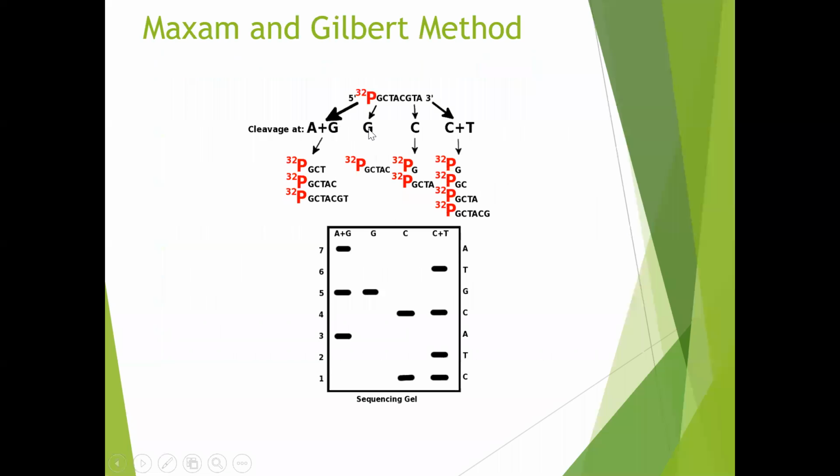So here there could be guanine, and with the guanine you will have only one product, actually one more here also that should have been the product formation. Anyway, if this is not clear, what you need to understand is that at all possible sites there should be modification and the cleavage should take place.